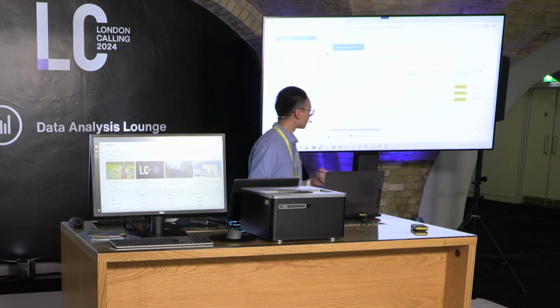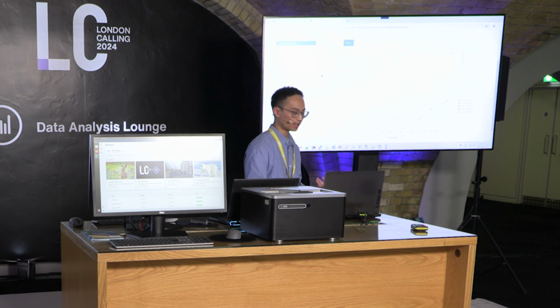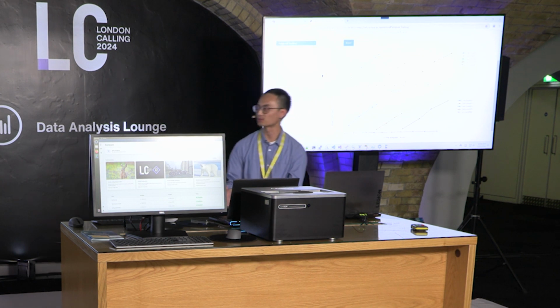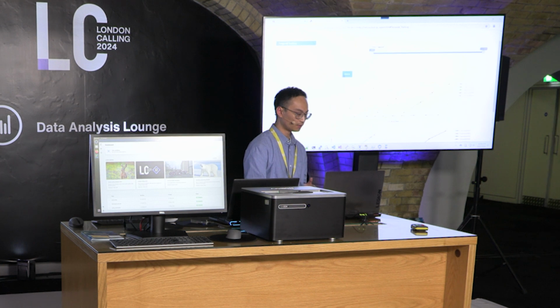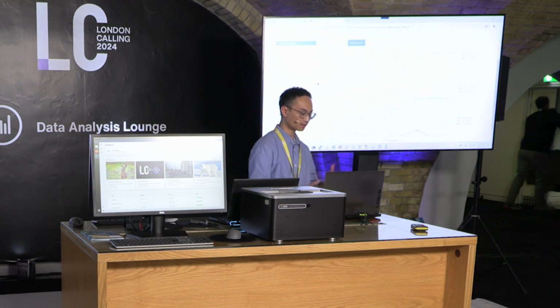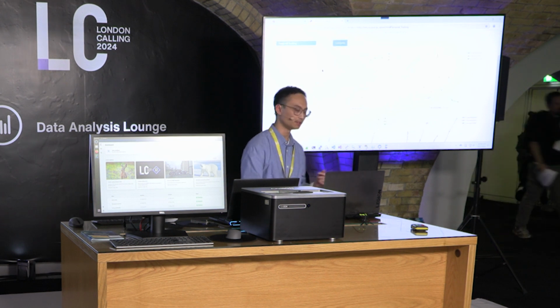Now, there is a second tab here, which is called temporal tracking, which provides you that temporal dimension, meaning that we can actually look at these different sequence metrics as a function of time. And so we can actually go to the assembly statistics tab, which would actually tell us as sequencing time goes on. Let me just switch over to the contiguity tab.